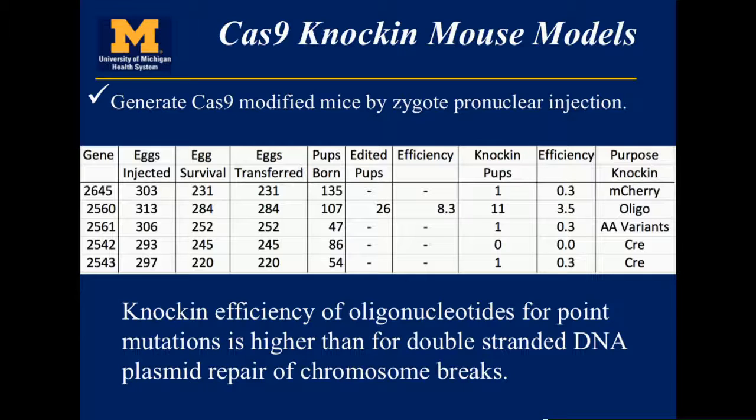There are a number of reasons for this, mostly locus-specific effects, the design of the gene targeting vector, and then the sensitivity of the screen, because typically with a PCR screen with an inside primer and an outside primer, you don't get a chance to validate the sensitivity of the screen before you get to the mouse stage.